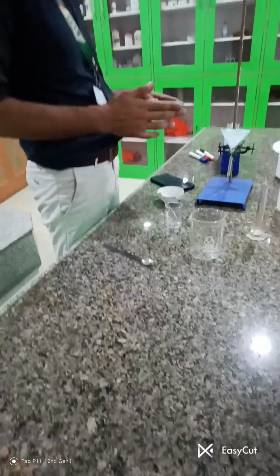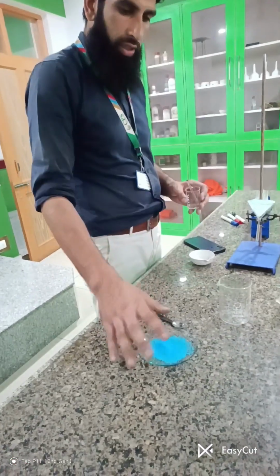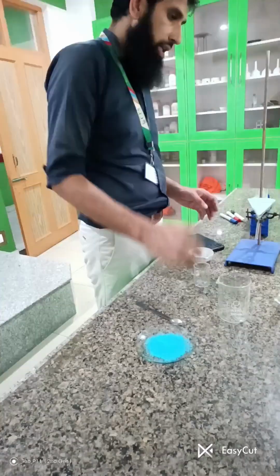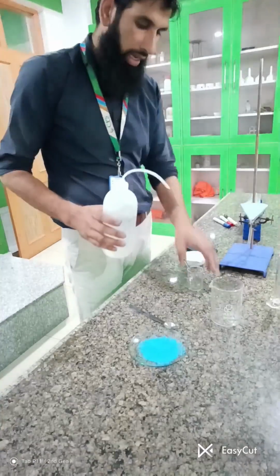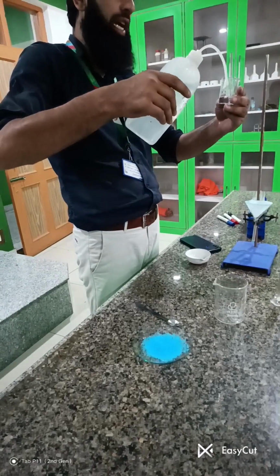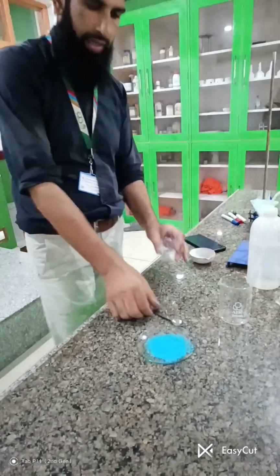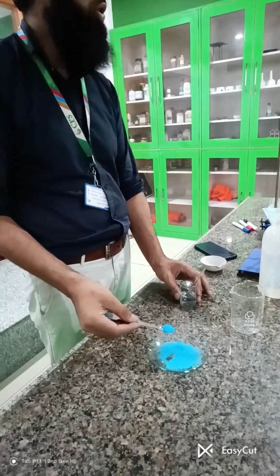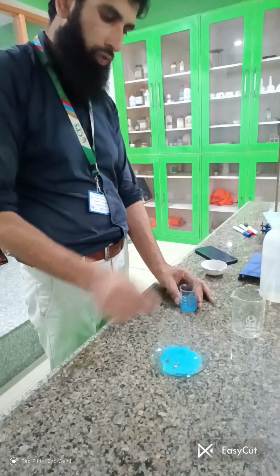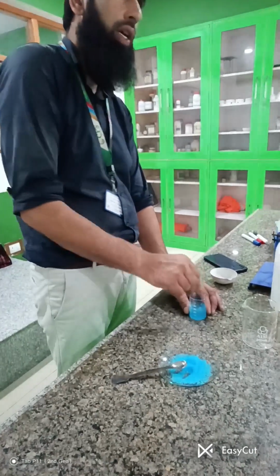Impure copper sulfate. And what do we do? We will dissolve this impure copper sulfate in 30 ml water. This is distilled water. I will add 25 to 30 ml water in this beaker and add this impure copper sulfate to it and make a solution. And we must stir it continuously so that it will dissolve in the water.